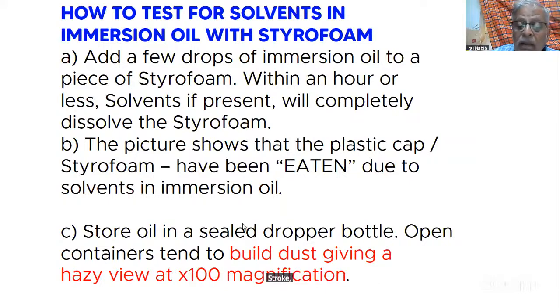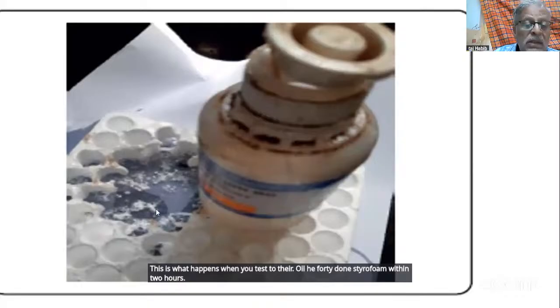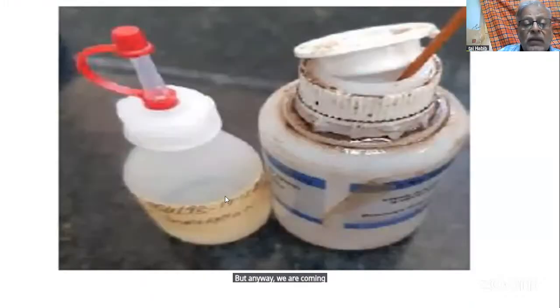Store oil in a dropper bottle, not in an open container. This is what happens when you test the oil. You put it on styrofoam, within 2 hours, it's eaten everything. A good oil should not do that. Castor oil doesn't do that. When you buy it, you can try it. It will not do this. But anyway, we are coming to castor oil.